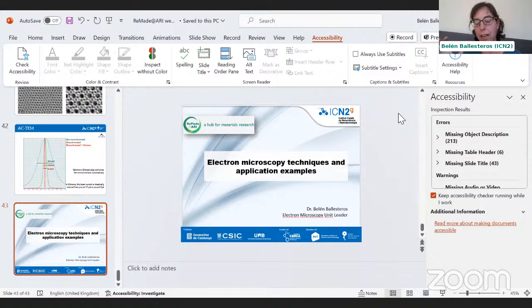So this has information on the nature of the atom that you are detecting. And as you said, you can have it both in the SEM and the TEM. The information you get is not just of the surface, so it penetrates several microns inside the sample.